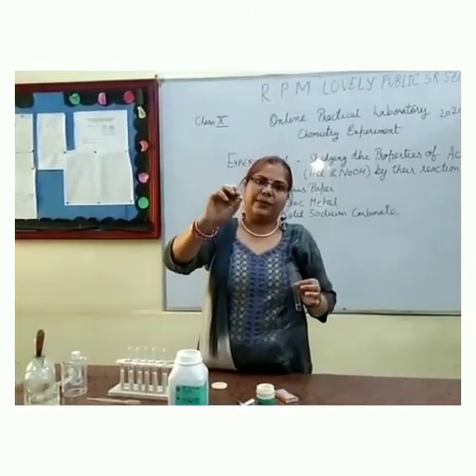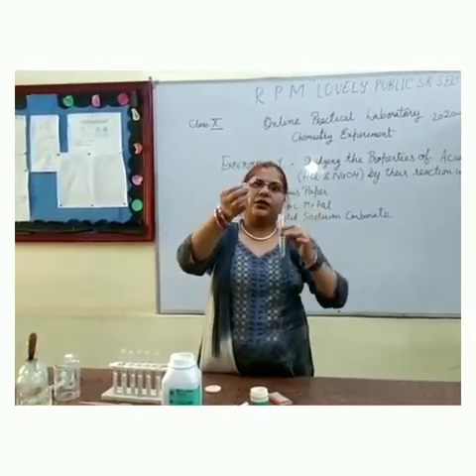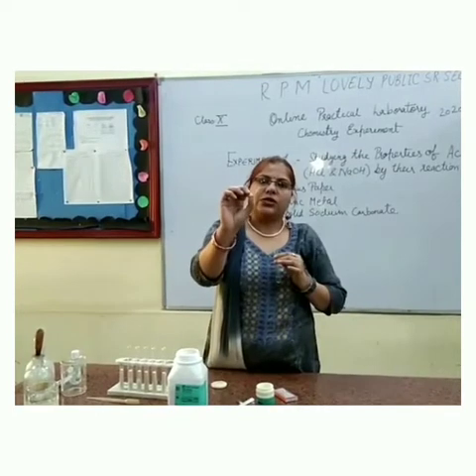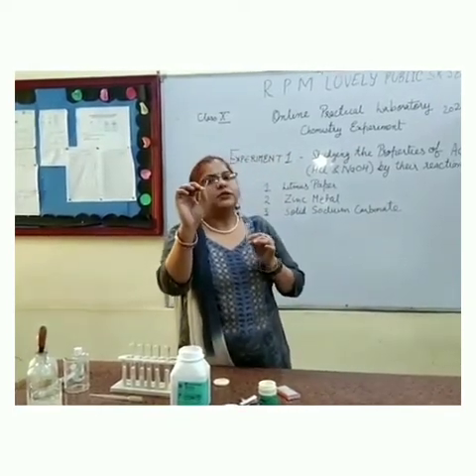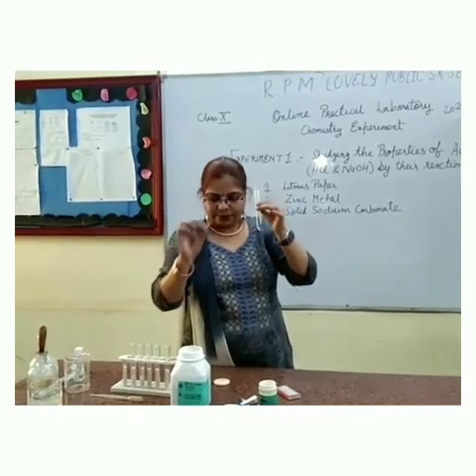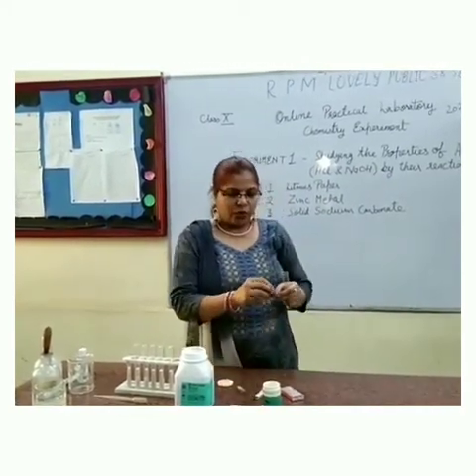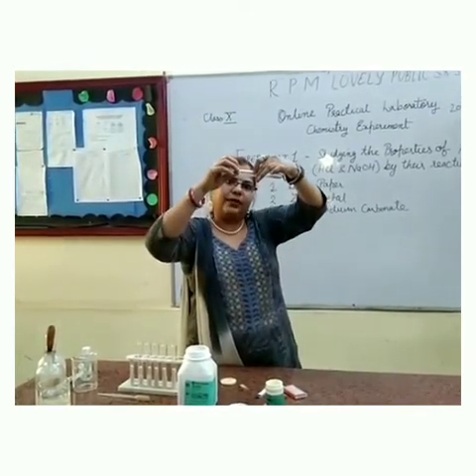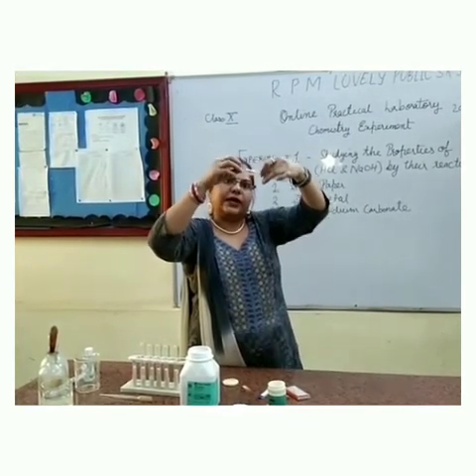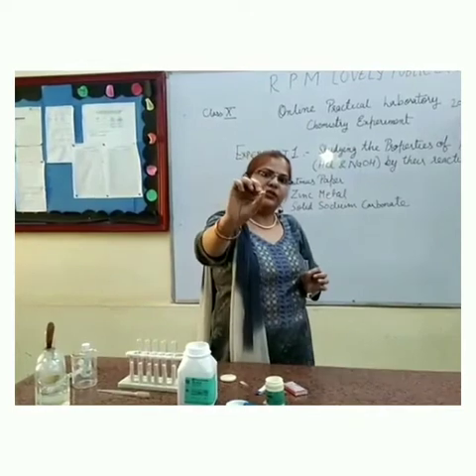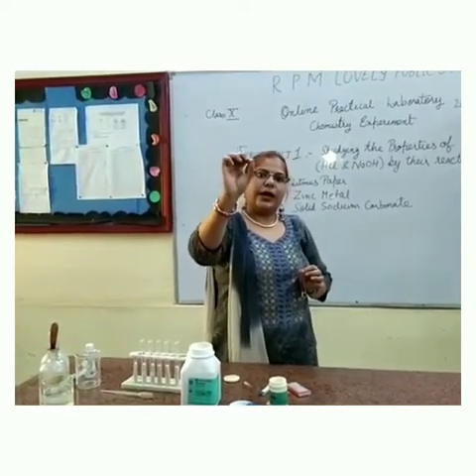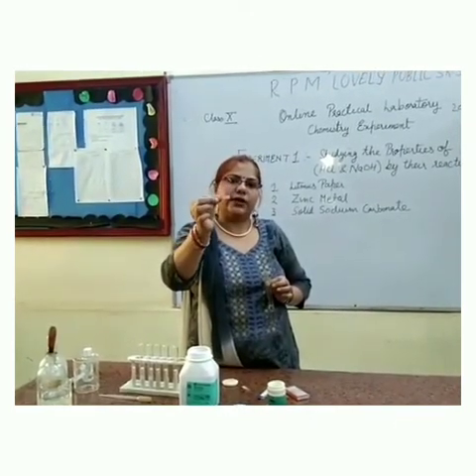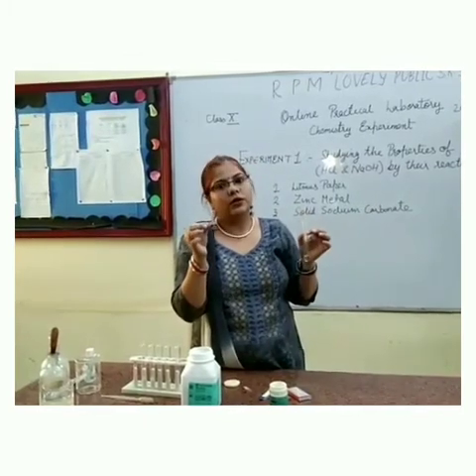When we take red litmus in this acid, you can see that there is no change — no change of colour. This shows that red litmus does not react with the acid. Now, we will put a small strip of blue litmus in the same HCl, and we can see that the colour of the blue litmus changes to red. That means acids turn blue litmus red when it comes in contact with acid.